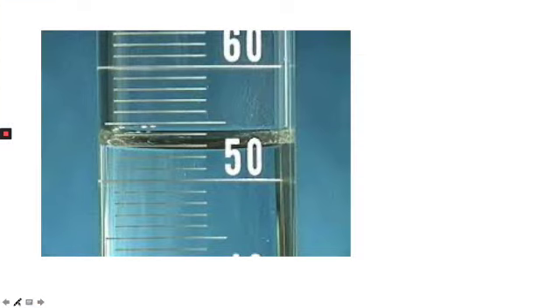So here it is. I'm going to show you mathematically how to do this, so when you hit one that's not easy, you know how to do it. First thing you have to do is subtract the two known graduates, 60 and 50. It doesn't matter which two graduates you pick, just pick two. You can even, if you had 40 or 30, you could have picked those.